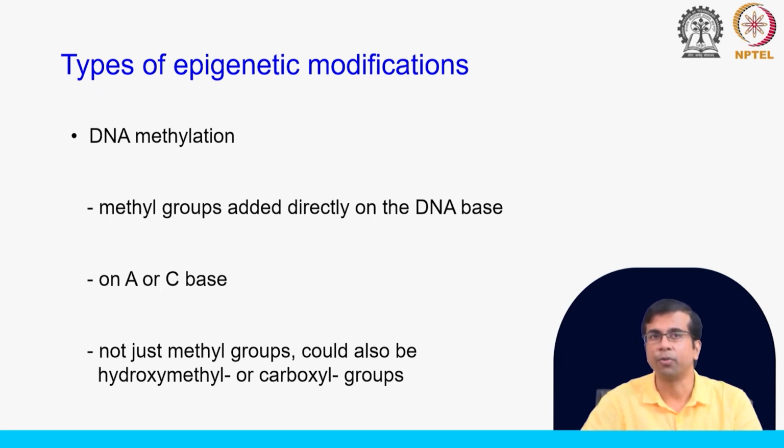We will talk about this in much more detail in the subsequent class, where we will specifically focus on DNA methylation. It is important to know these modifications, because then you can devise strategies to identify them using next generation sequencing methods. As you can see, without chemical treatments or experiments, we cannot directly detect this with the traditional next generation sequencing methods, but the newer single molecule sequencing techniques can help us identify them directly.